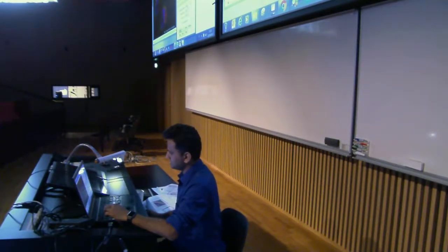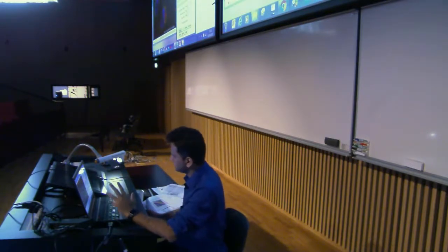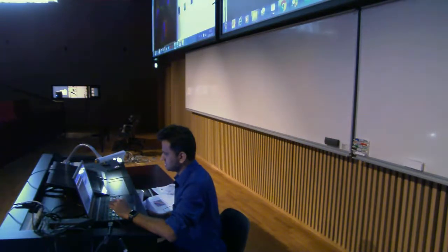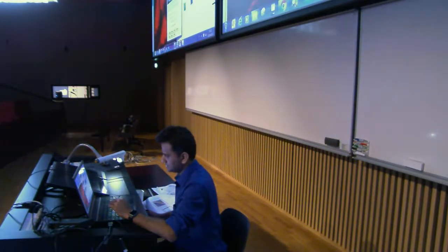So sometimes you just have to switch off your FIJI and open it again, so it's not that stable. You see. So maybe make this showing image, make it as RGB, click off, go image, color, adjust, color threshold, now it works.